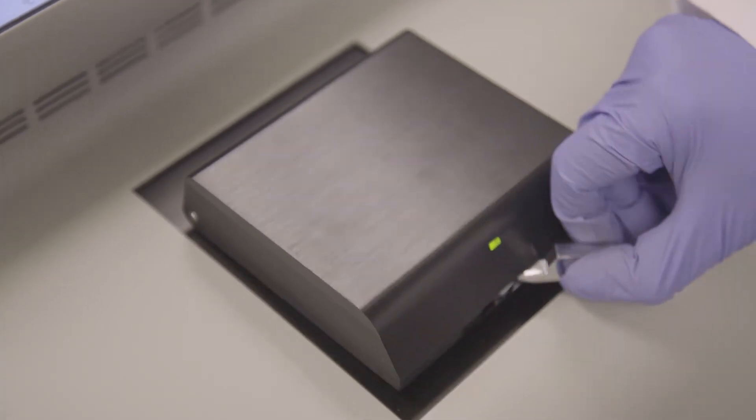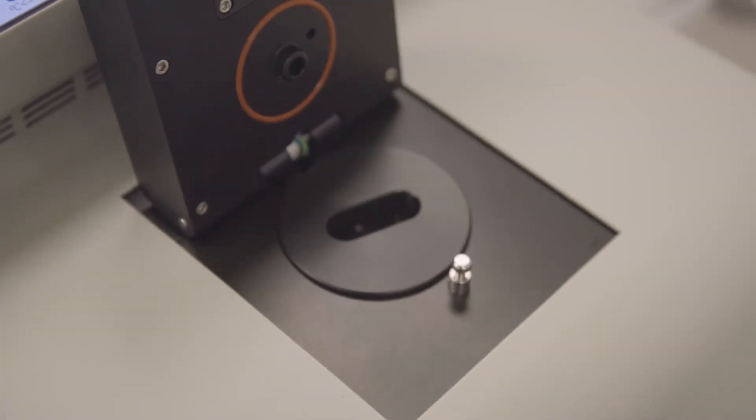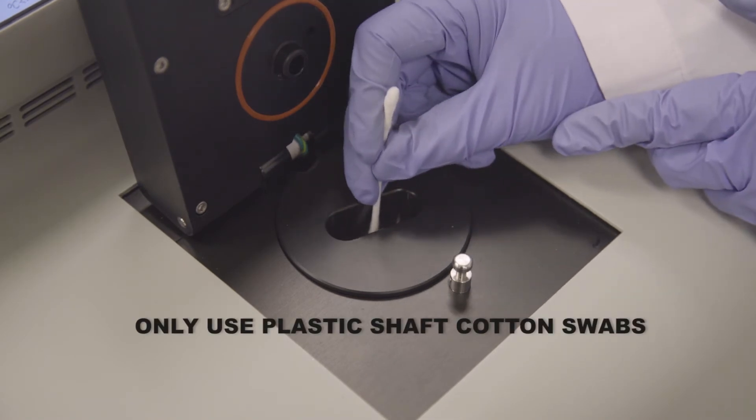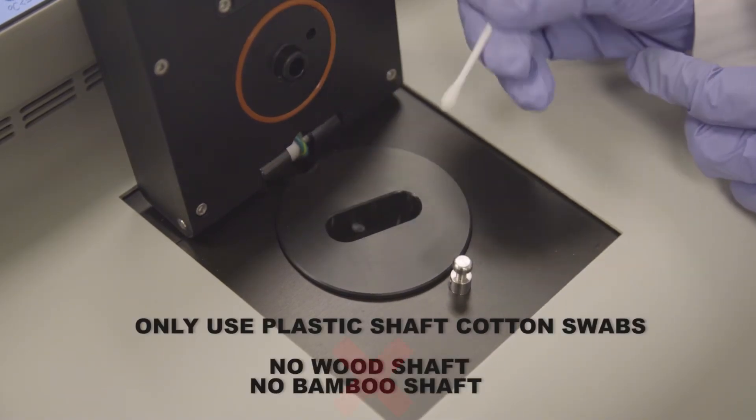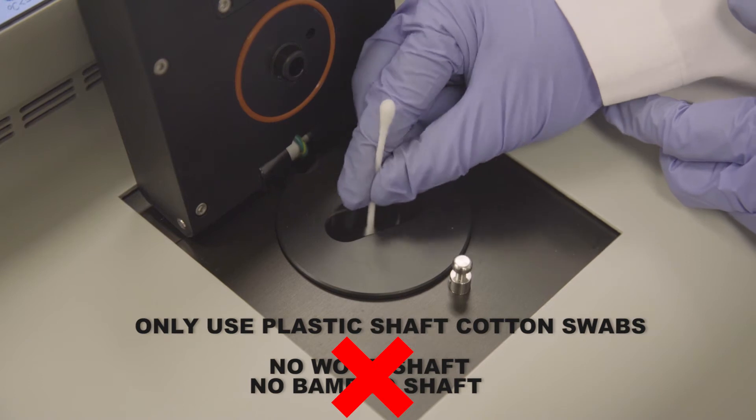To clean out distillate samples such as jet fuels or diesels from the sample cup, first remove the sample and dry the cup with a clean cotton swab. Gently swab around the inside of the cup to speed up the drying.